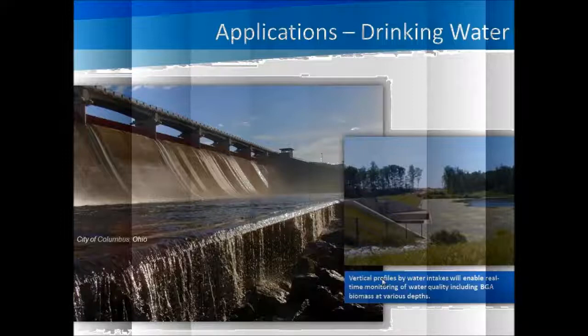In most of the major drinking reservoirs in the United States, the vertical profiler system is currently being deployed on sondes, measuring algae, turbidity, and DO throughout the water column 24/7.